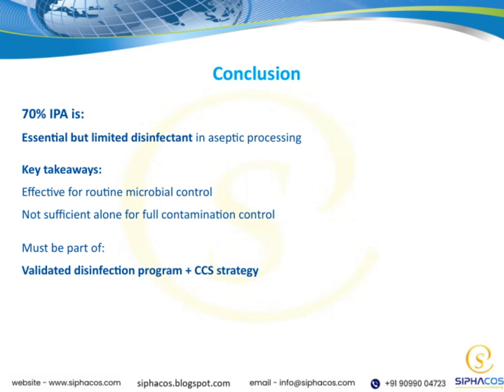To truly ensure safety and sterility, 70% IPA must be part of a validated disinfection program combined with a comprehensive contamination control strategy. When used effectively within this framework, it helps us maintain the high standards necessary in aseptic processes.